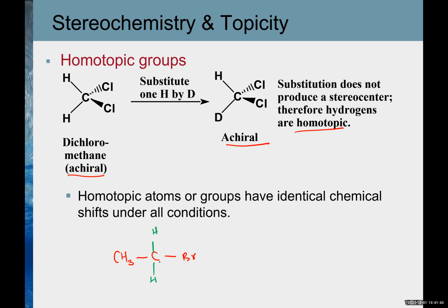In the beginning, we would have said they are equivalent, but they're not. So they are either homotopic, enantiotopic, or diastereotopic. Let me know what they are.